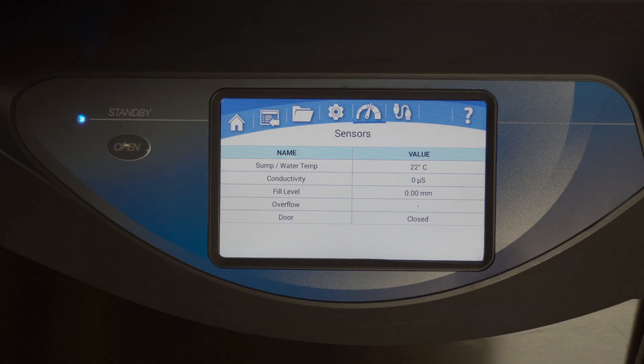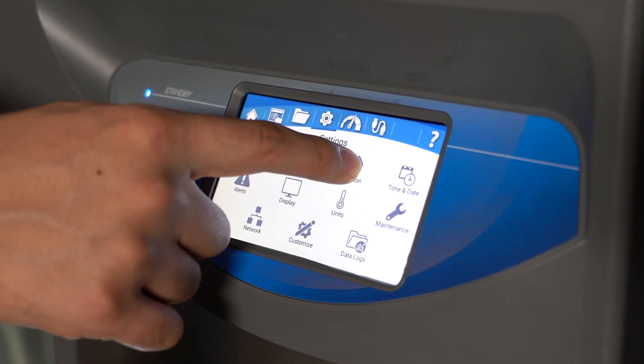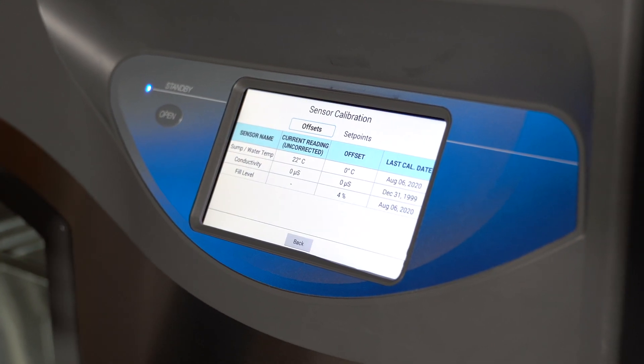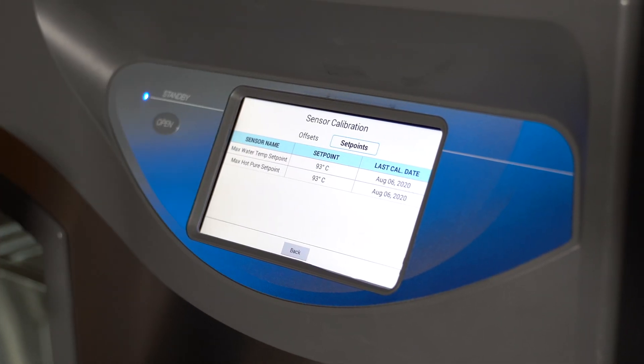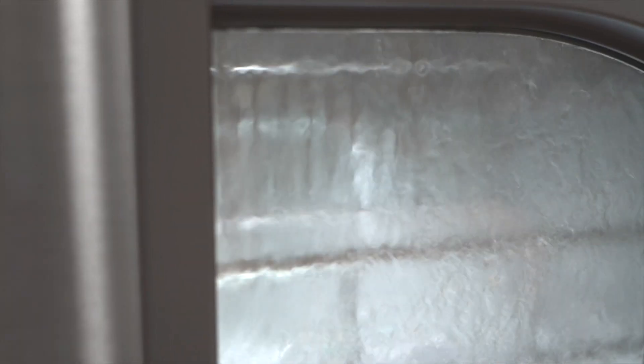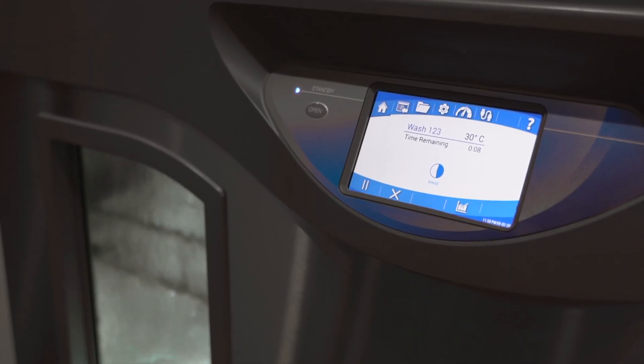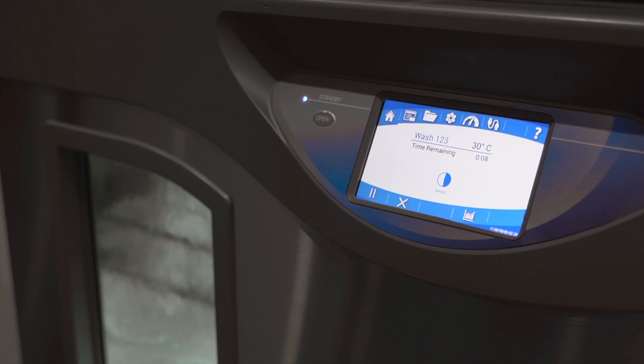The CleanWorks operating system is more than just a brilliant 5-inch touchscreen display. It provides intuitive controls to create and save up to 200 programs. Program up to 8 rinses of tap water or purified water, with adjustable wash and rinse temperatures up to 93 degrees Celsius, and a steam generator to ensure consistent residue-free results.